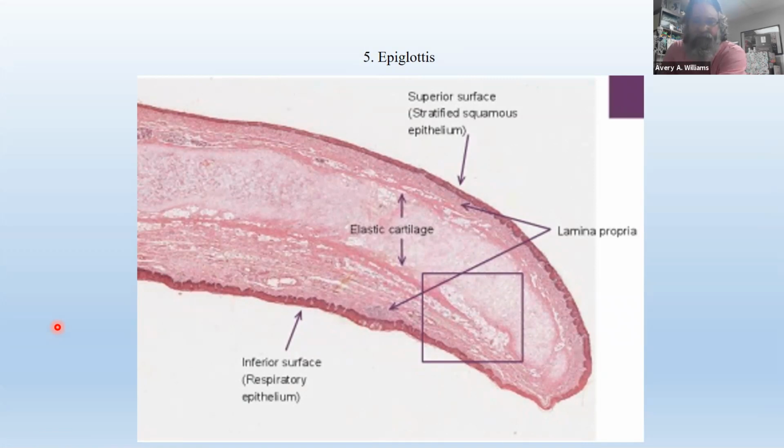First of all, you remember what the epiglottis is? It's that flap that closes over the opening to your voice box when you swallow. The opening to the larynx is called the glottis. Get it? Glottis, epiglottis, above the glottis, it closes over. And here it is. This is a section taken, not human, probably taken from a little mouse.